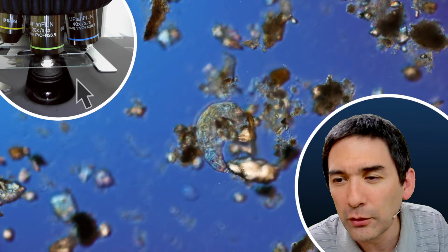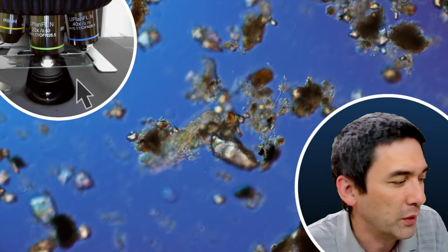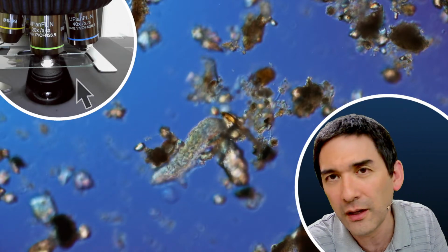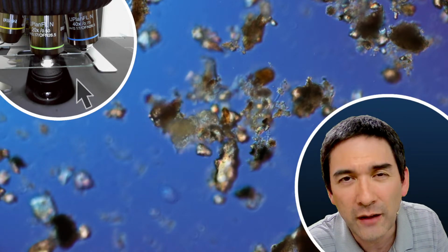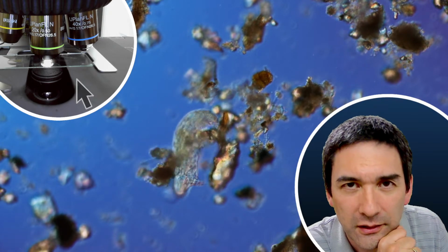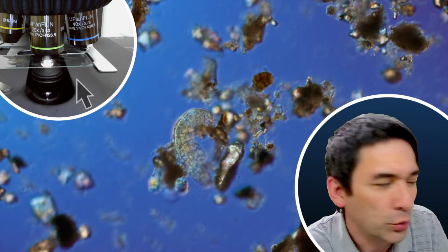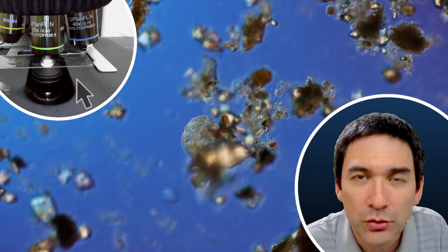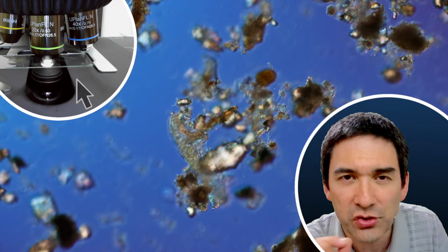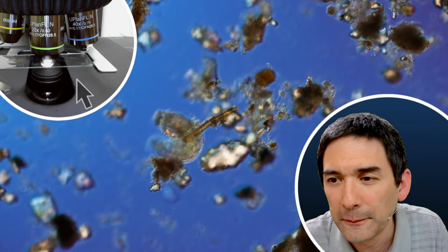Is it okay to use a microfiber cloth? Well, it depends what you want to clean. If you want to clean the actual objectives, you should not use a microfiber cloth either. You have to use lens paper, and you have to be very careful. You should not apply any pressure when cleaning, because as soon as you apply pressure to the optics, you might end up scratching the surface, since there might be a small sand grain or dust grain. So no pressure at all.